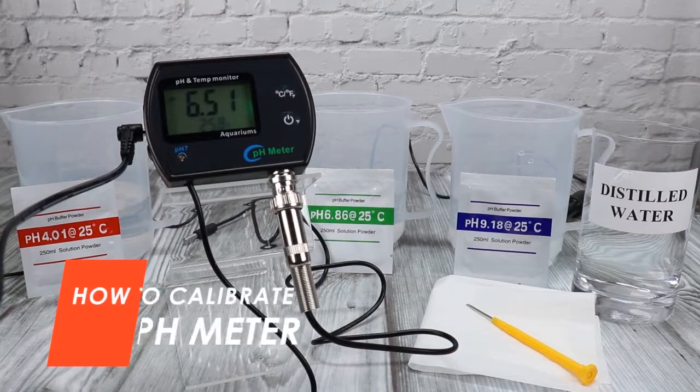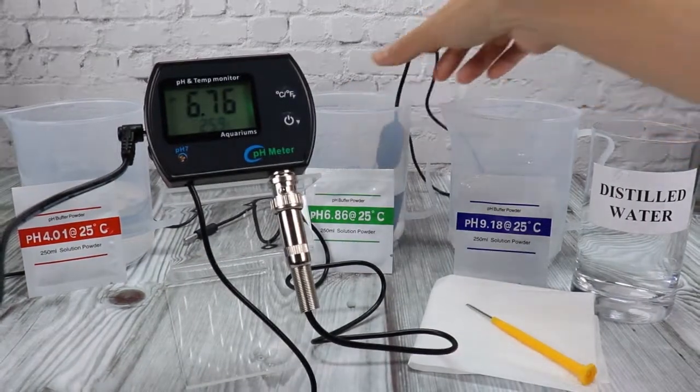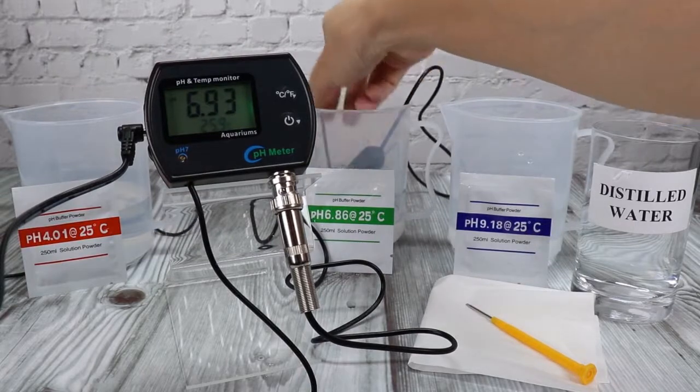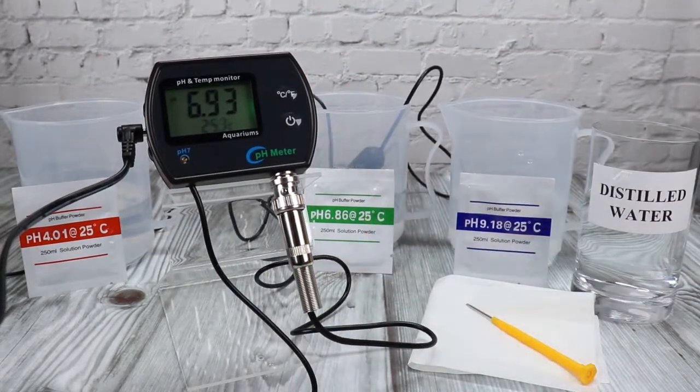To calibrate the pH meter, wash first the electrodes with distilled water, then submerge the electrodes in the pH 6.86 buffer solution. Make sure it is fully submerged to get the correct reading.